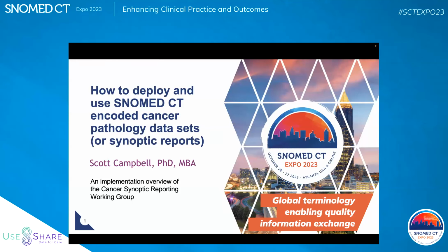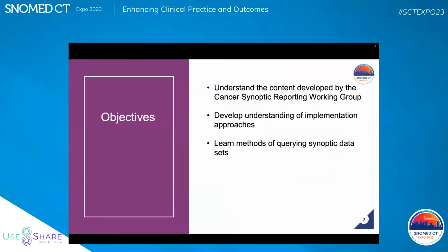Training sessions and efforts to help people understand the content that was created, how to implement this, how to deploy this in your clinical information systems. And that's cancer synoptic reporting, structured cancer synoptic reporting using SNOMED CT.